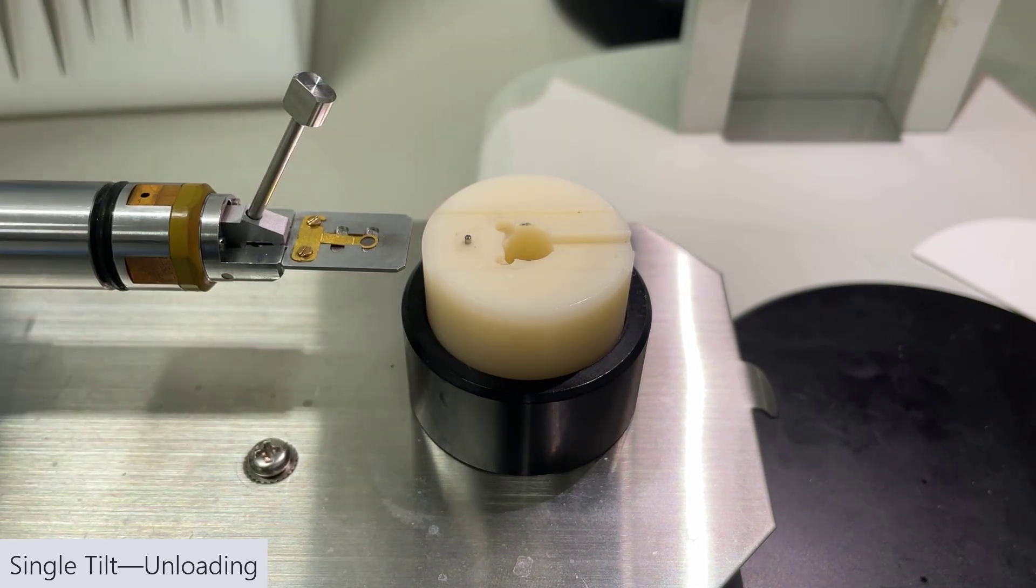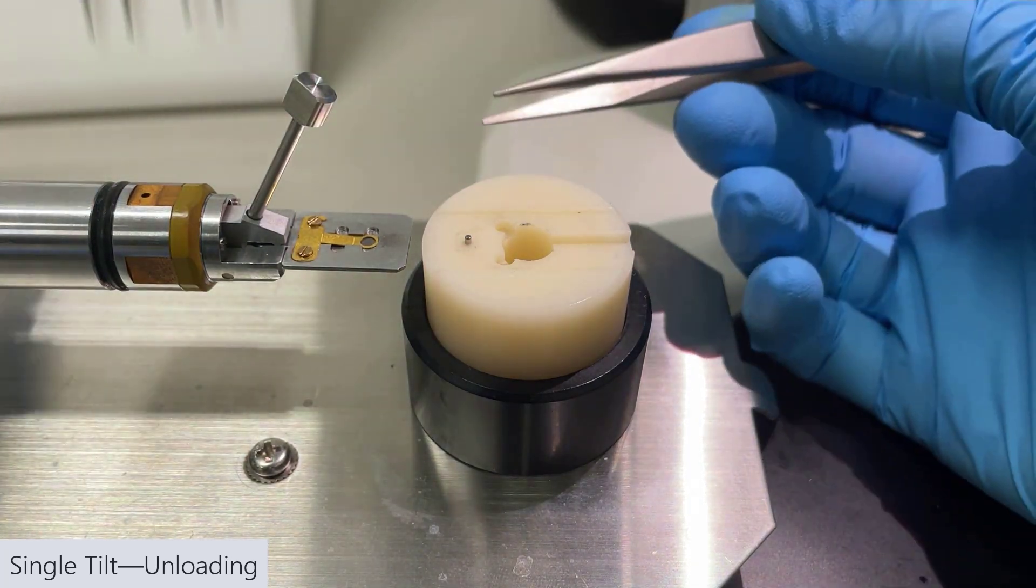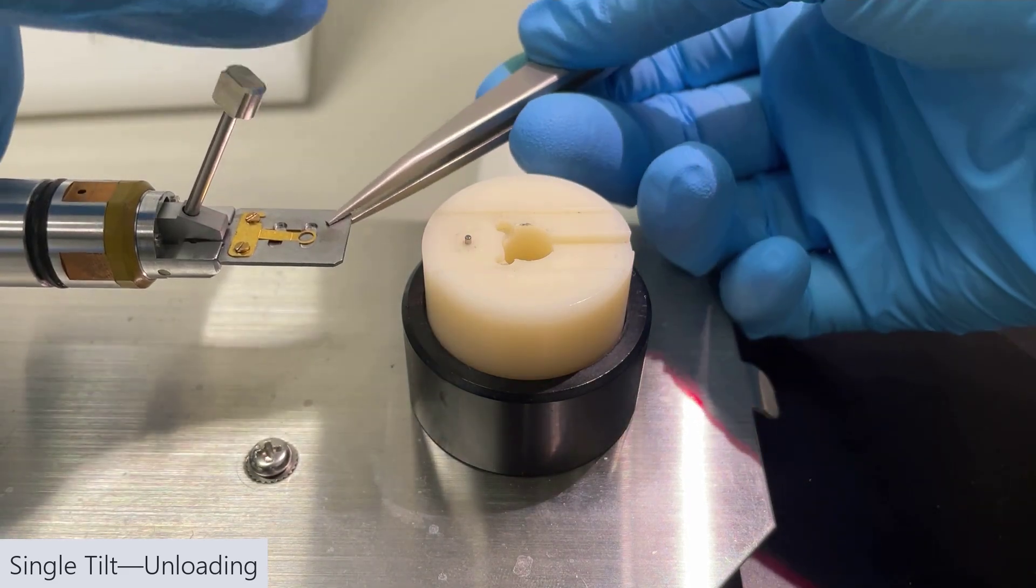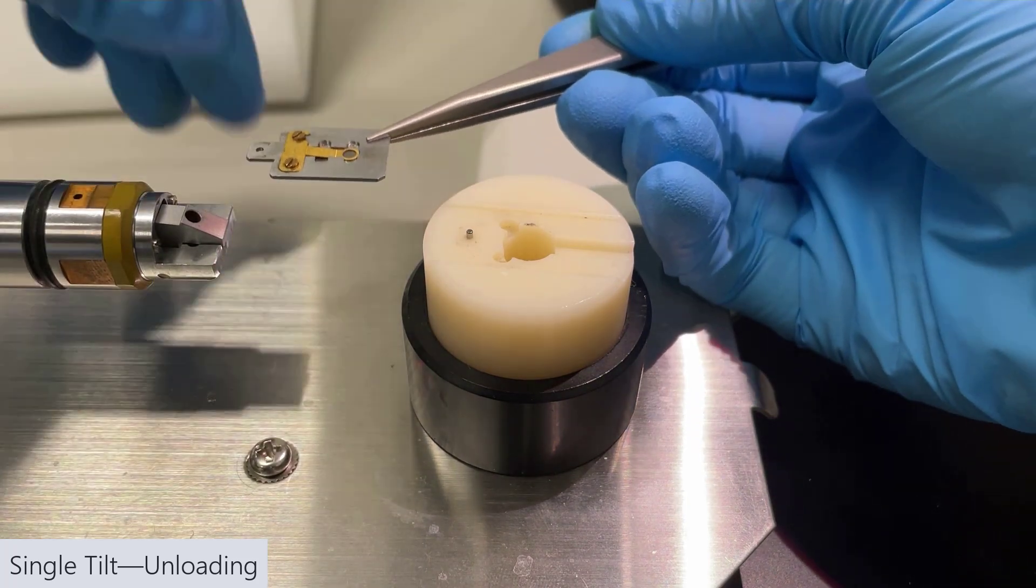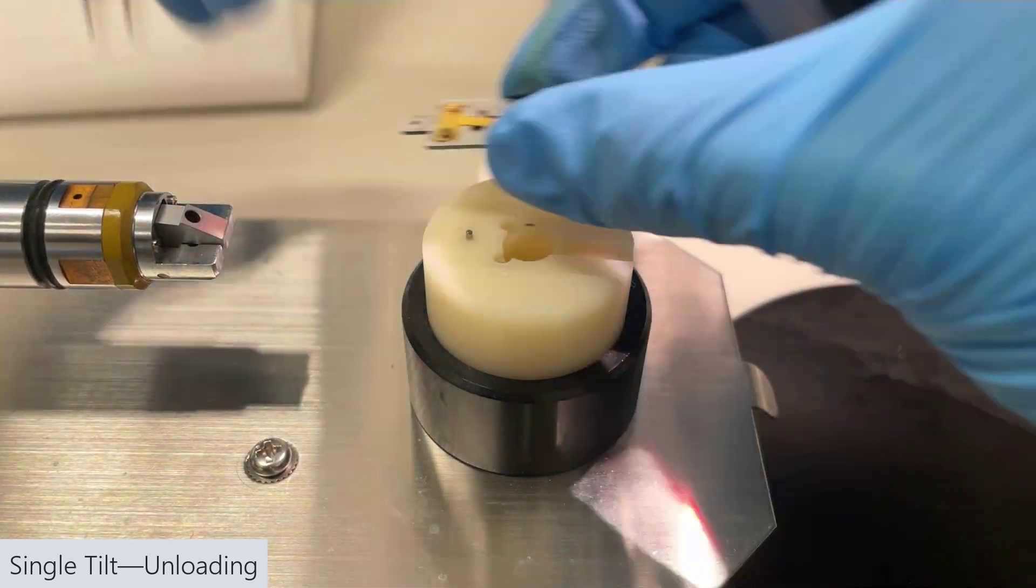it's the same process in reverse. We're going to go ahead and take the blade off of the holder. You can use your hands. I'm using thick tweezers here. Then we're just going to put the blade in its little holder.